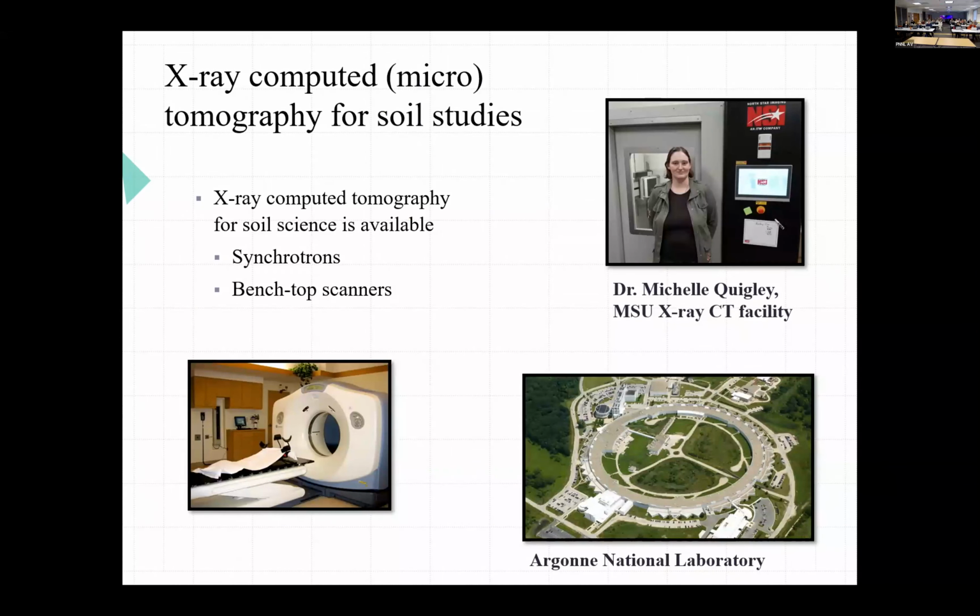Until relatively recently, working with those sieved soils was the only option that soil scientists had. But fortunately, with the development of X-ray CT and big progress in it, it became possible for us to look at soil structure and soil pores in their intact shape. Even though we're looking at fairly small soil samples, still they are intact.